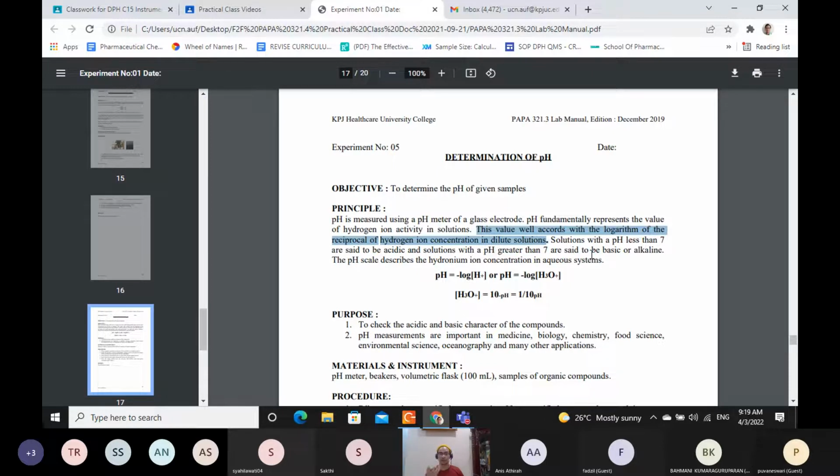So kalau larutan kita punya tu terlalu pekat macam cream, so dia tak boleh detect the hydrogen ion yang ada because hydrogen ion tak boleh terhasil sebab tidak ada solution. Okay, ions usually exist in dilute solutions. Bukan exist, easily detected. Okay, itu description yang lebih tepat. Ion lebih mudah dikesan dalam keadaan di dalam larutan.